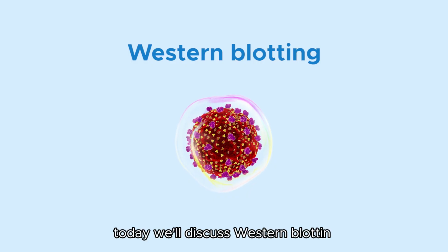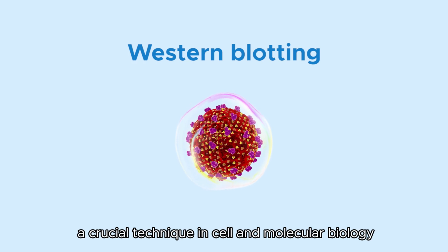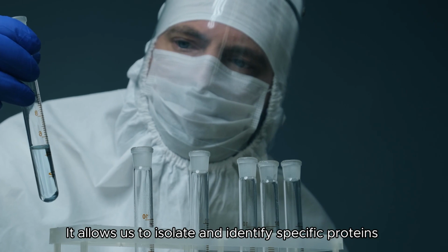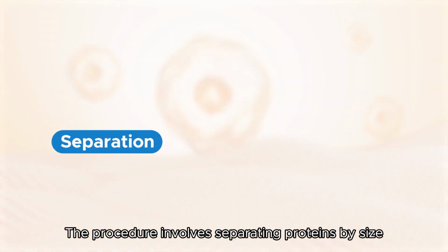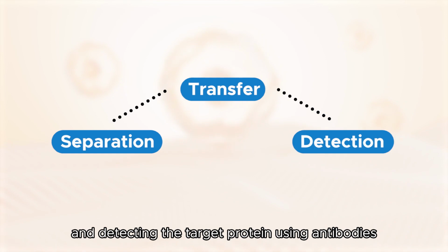Hello, everyone. Today we'll discuss Western blotting, a crucial technique in cell and molecular biology for protein separation and detection. It allows us to isolate and identify specific proteins from complex mixtures, like cell lysates. The procedure involves separating proteins by size, transferring them to a solid support, and detecting the target protein using antibodies.